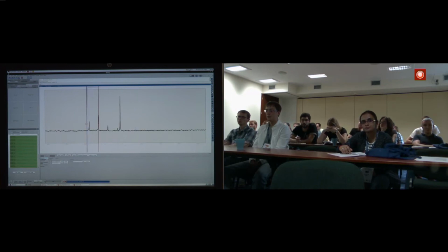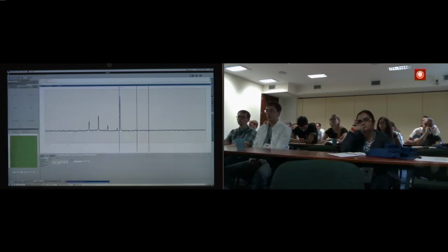And, well, this spectrum gives you a hint that you can really perform solid-state experiments, and you can, at least for carbon-13, reach a high-resolution spectrum, with nicely defined positions of your resonant NMR peaks. Of course, for more complex systems, you can expect many more signals, and probably they are going to be more difficult to analyze.